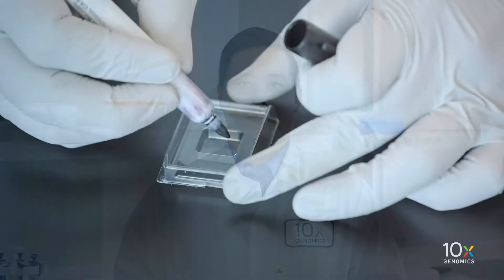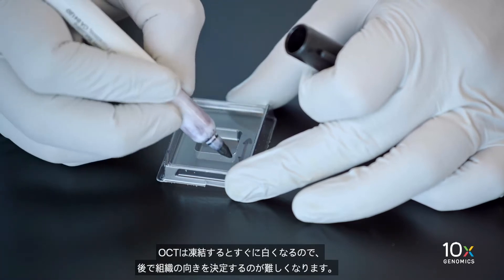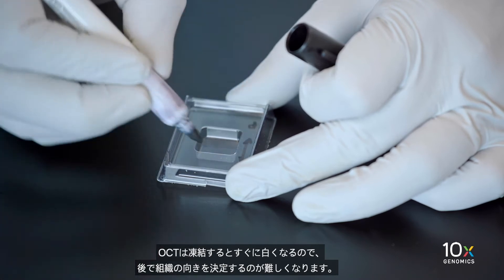First, label the cryo mold to mark the orientation of the tissue. Label the cryo mold before adding OCT and tissue. The OCT will quickly turn white once frozen, making it hard to determine tissue orientation later.